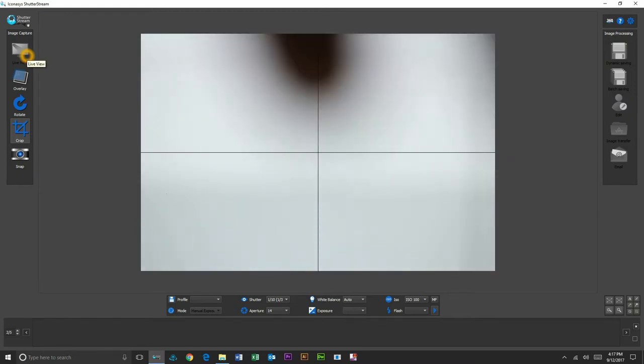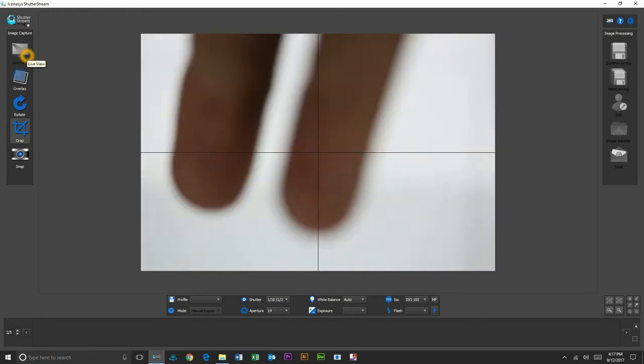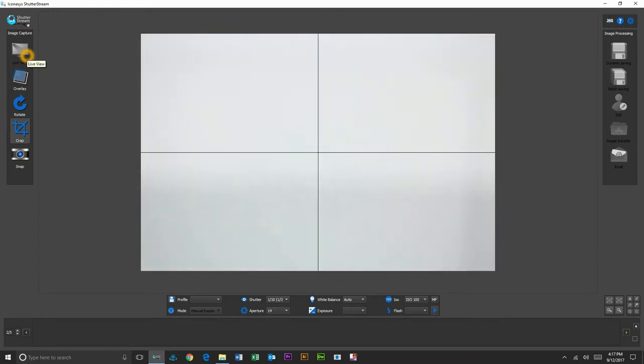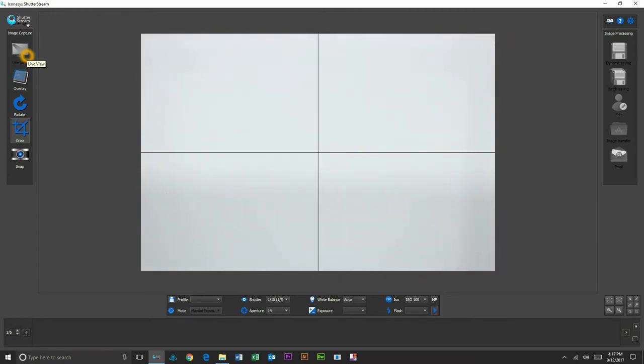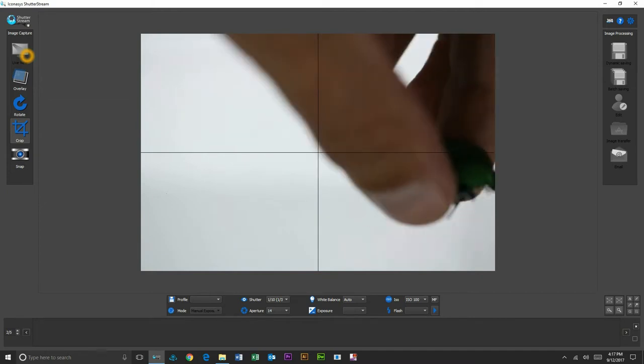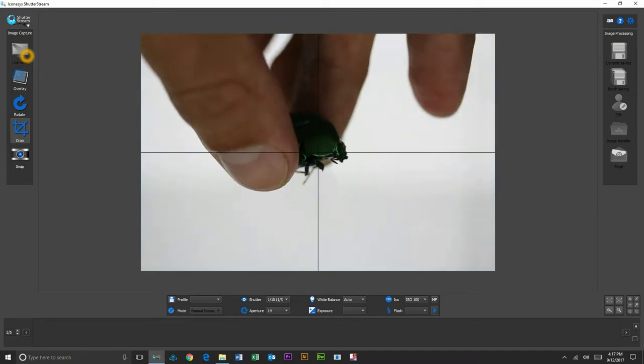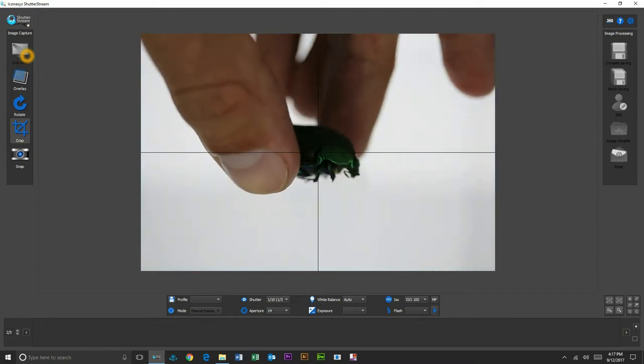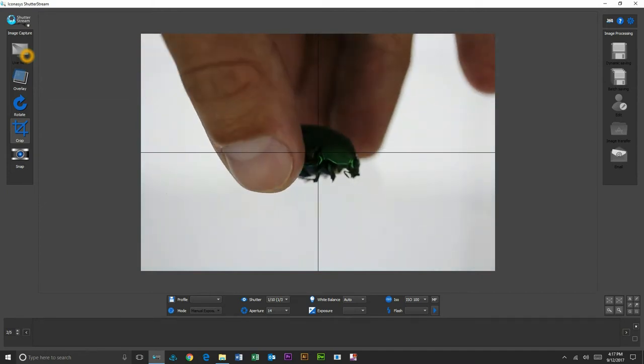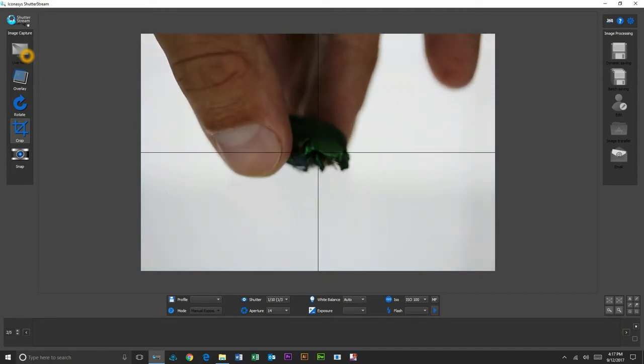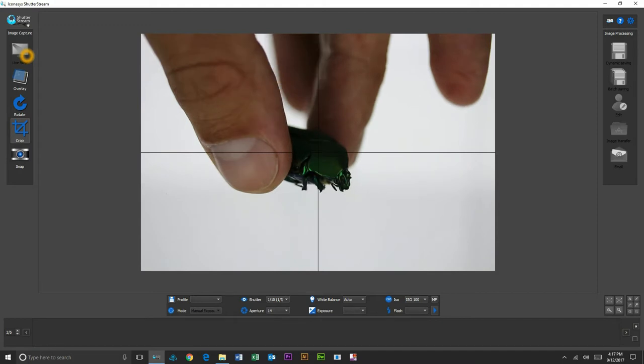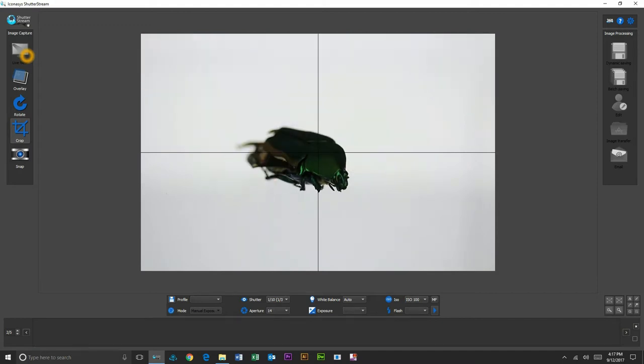I've enabled my camera's real-time preview, as you can see my hand going back and forth. I'm going to take my subject and place it in front of our camera. We're just going to place it in the center field of view here, and the first thing that we're actually going to notice here, it's a little bit dark.